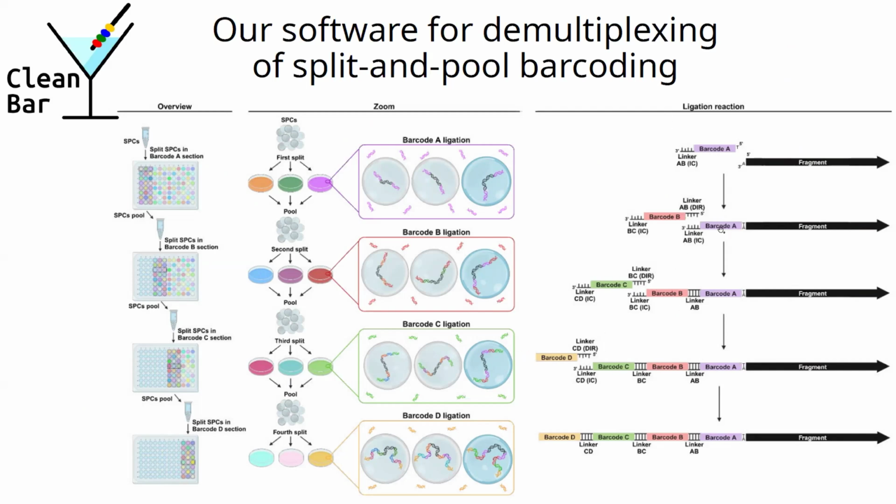And these barcodes are connected by ligations. They have linkers. There are 4 base pair linkers, and this is what actually facilitates the ligation. And in the ideal case, some of the fragments that you obtain will have the barcodes on both ends, but since the sequencing is not perfect, you just expect that all your fragments will have the barcode at least on one end of the sequence.